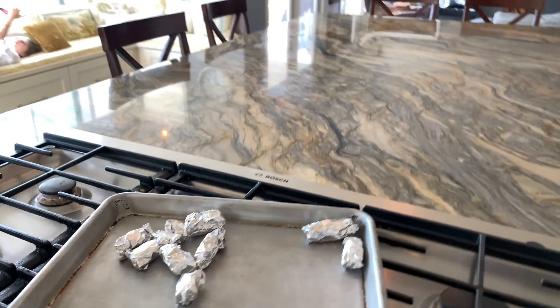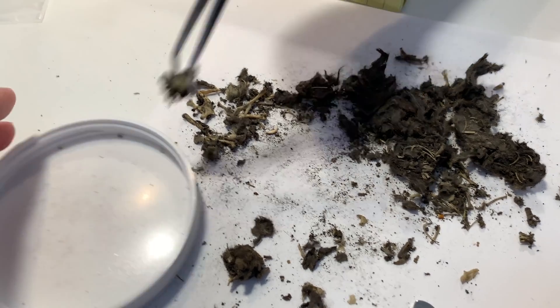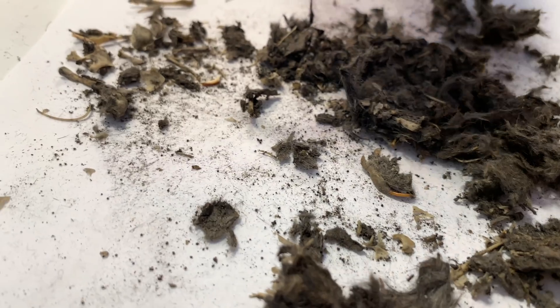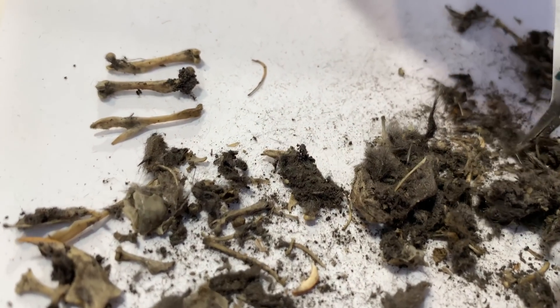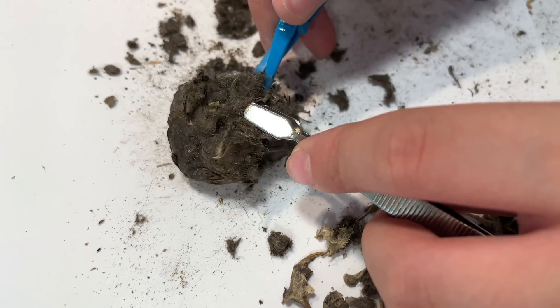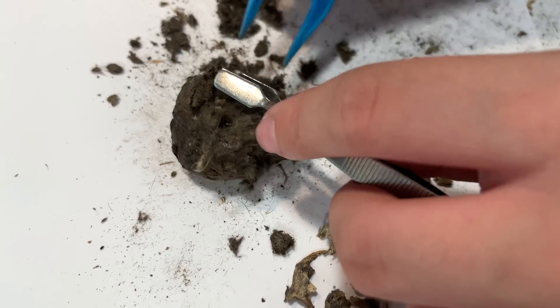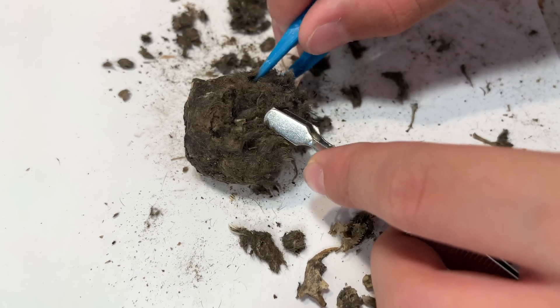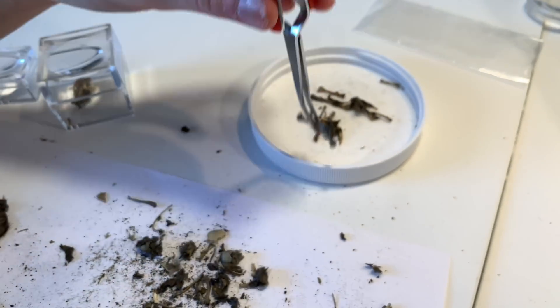The owl pellets have been baking for 45 minutes, so we're going to set them aside and let them cool. In the meantime we're going to continue working through those large owl pellets from the kit. Overall the large owl pellets were really fantastic — they came with a ton of stuff. It was a little bit pricey, so if you do find your own owl pellets in nature, bear in mind that you may need several of them.